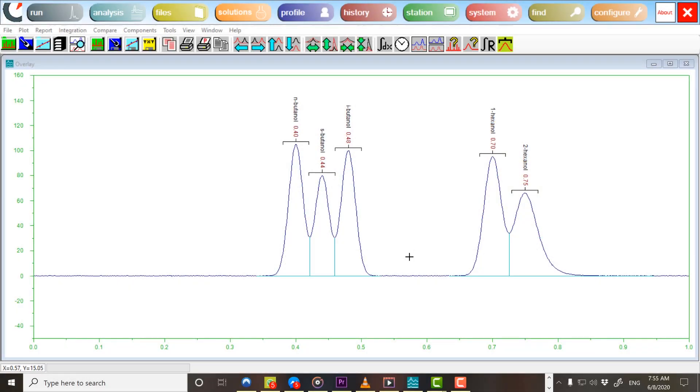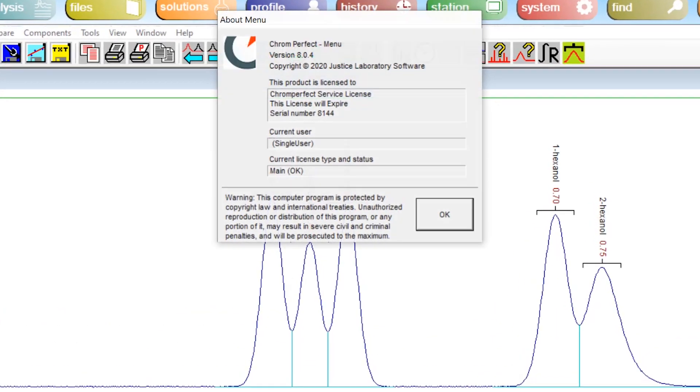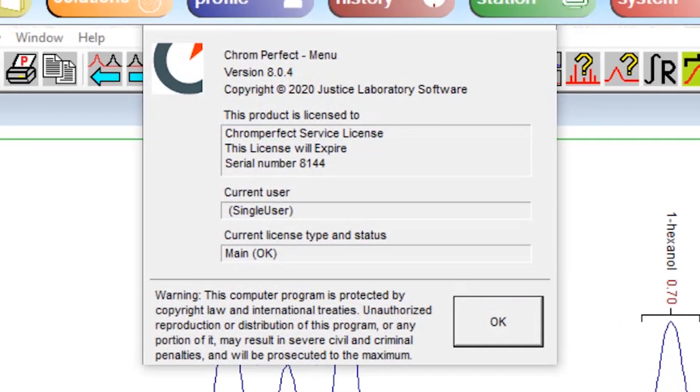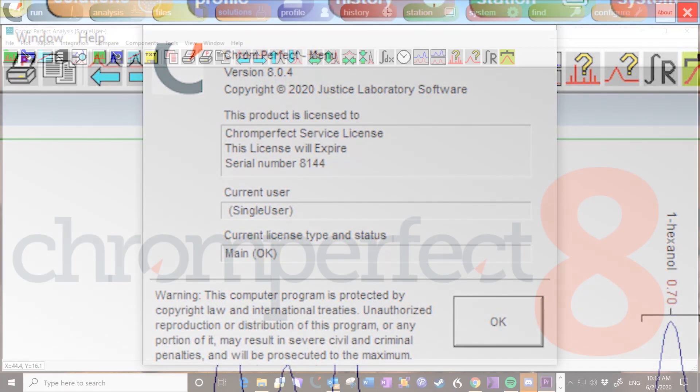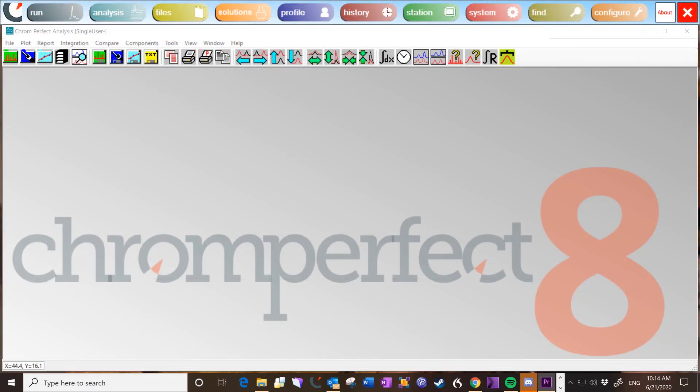This video was created with ChromePerfect version 8.0.4. Please note that the features and processes shown may be different in other versions. Let us look at how peak detection settings are applied within ChromePerfect.